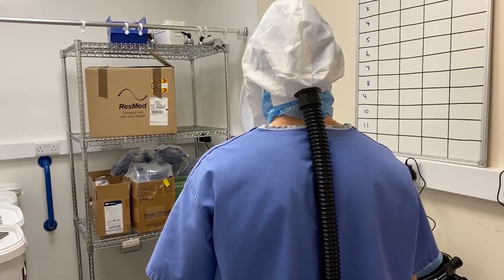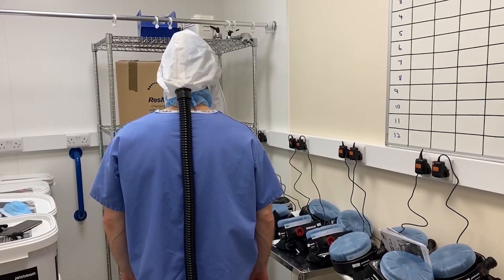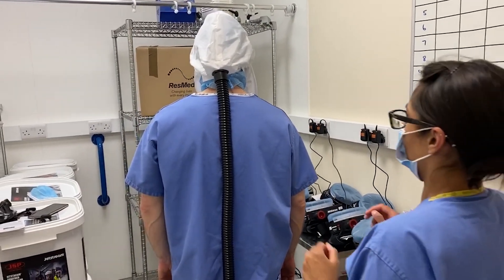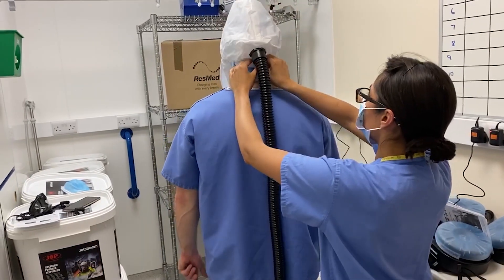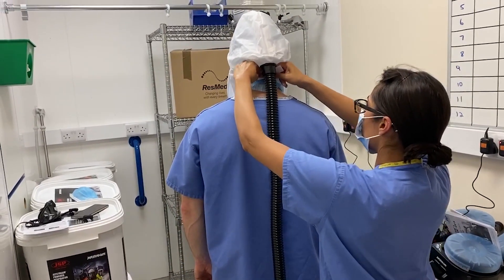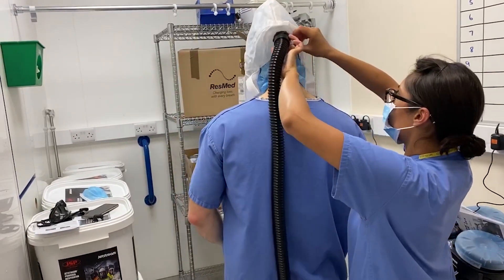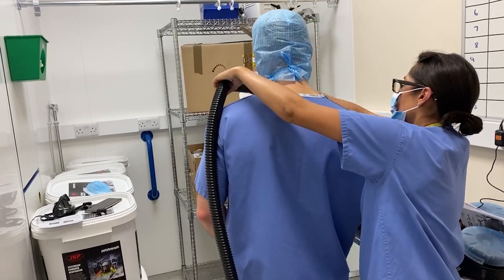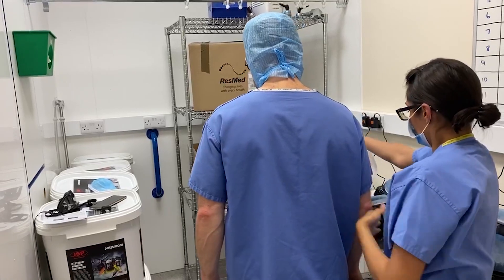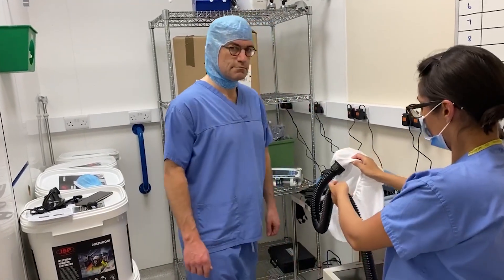Luke, step away from us so we can see how the hood is going to be taken off. Gurdip, how are you going to take this hood off him? So with gloves on, and this has been already wiped and cleaned, we remove the Velcro and just bring it forward and then down. So it went over the top and down, and it hasn't touched him and it hasn't touched you.